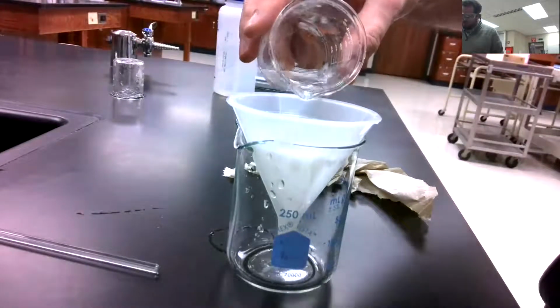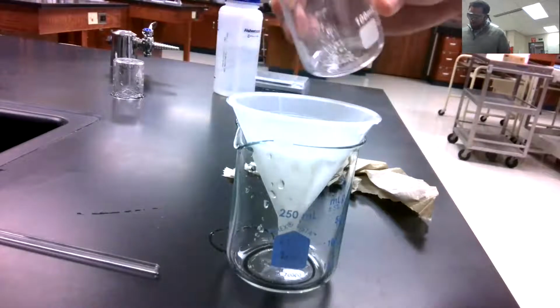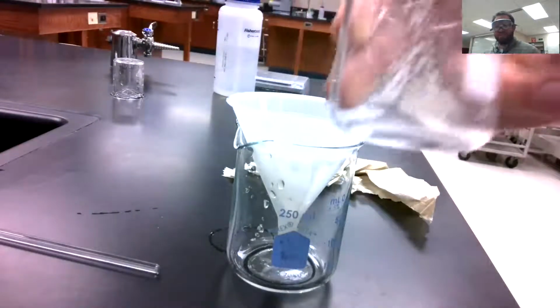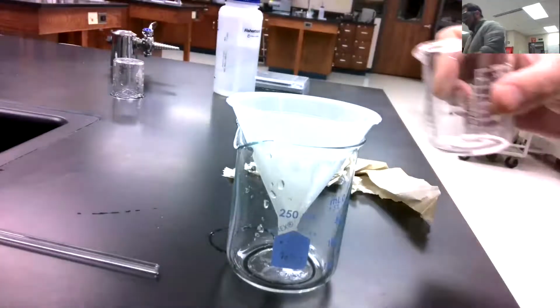Still working to get all my solid through there. Man, still got some. Kind of frustrating. Definitely can see that, right? All that white needs to be in my filter paper. So another rinse.